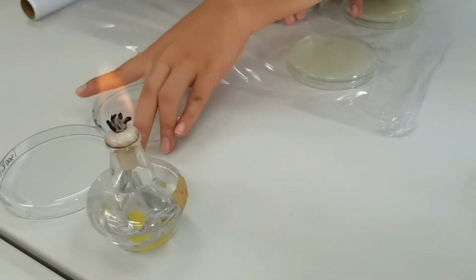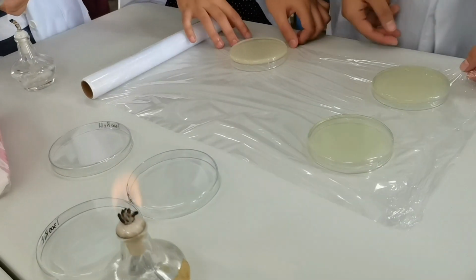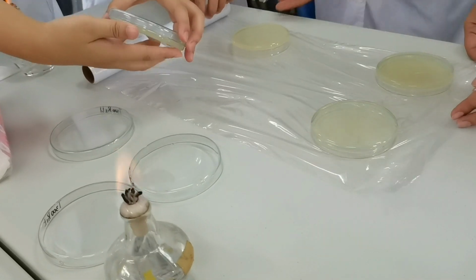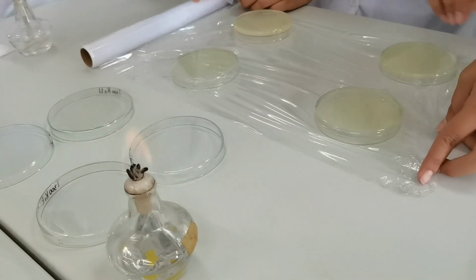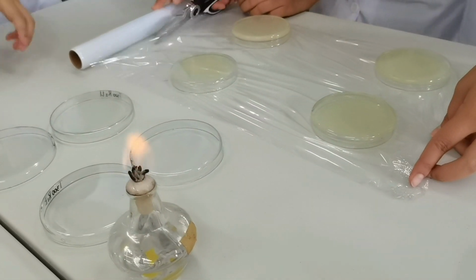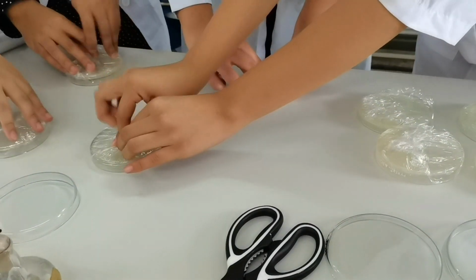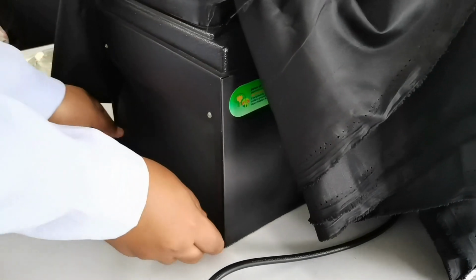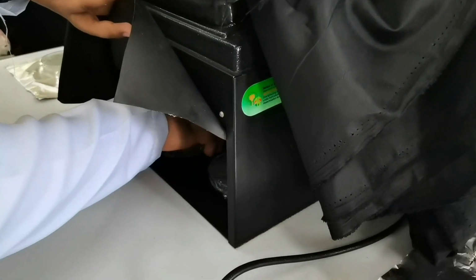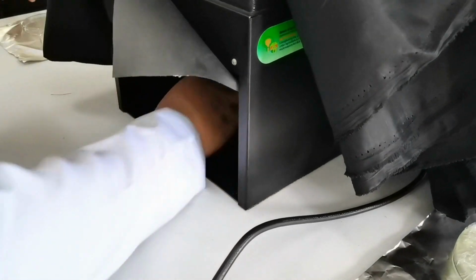At this point, they are preparing the plates for exposure to UV. So they have to remove the top plate and cover the bottom plate with the medium and the cells with a cling wrap. There, that's how they do that. So the plate is inverted. And now, it's time to put the plates in the box and expose them to UV at certain time points.